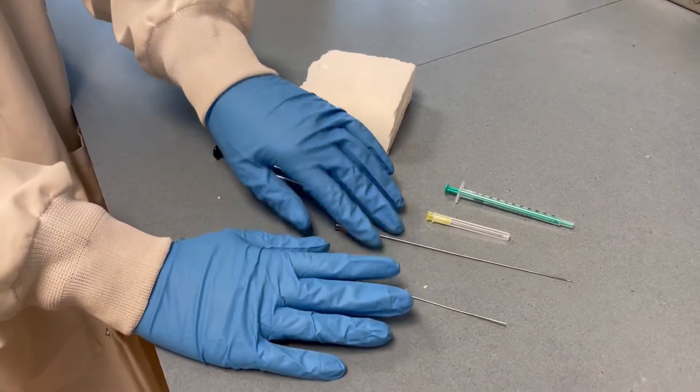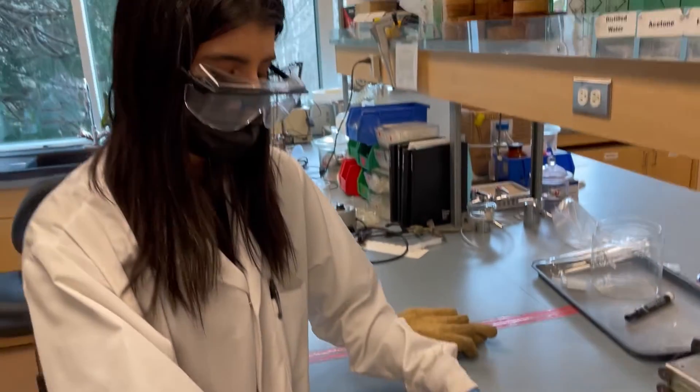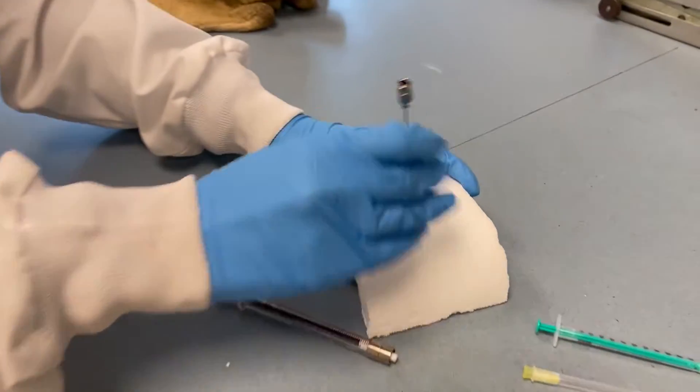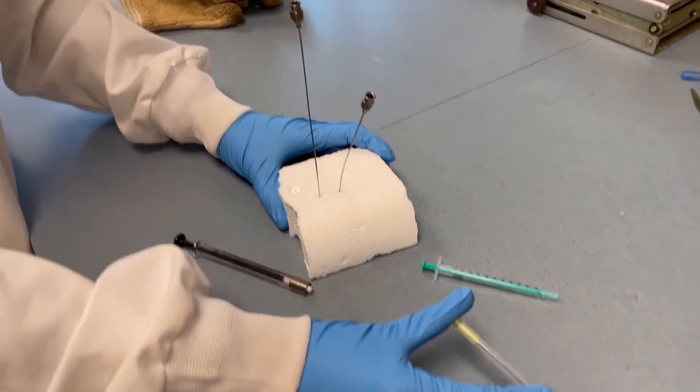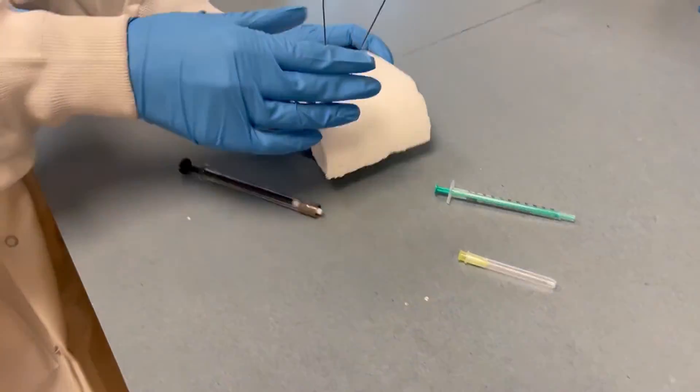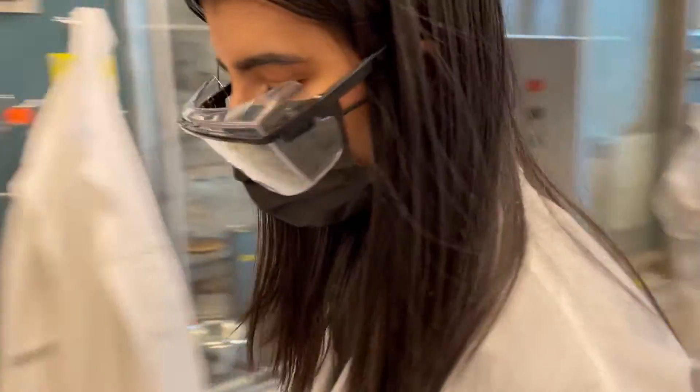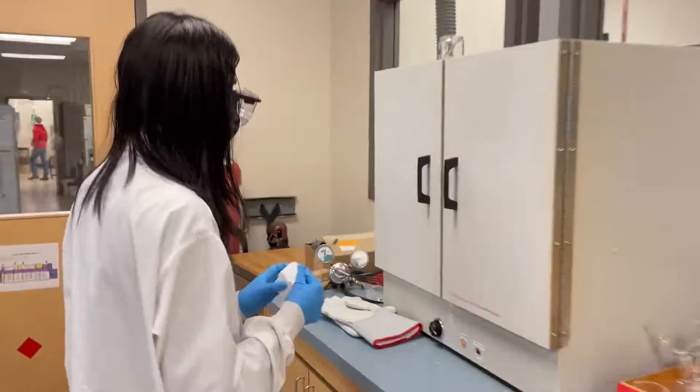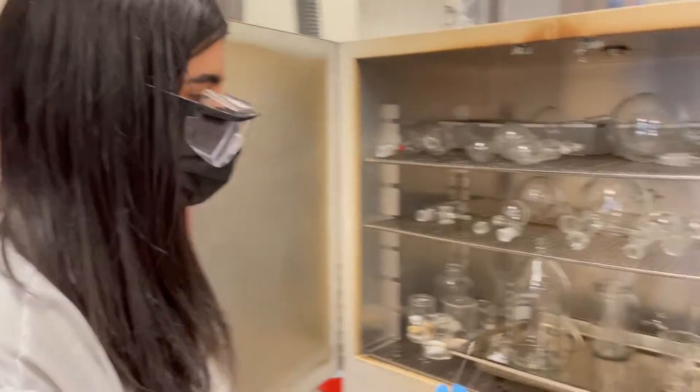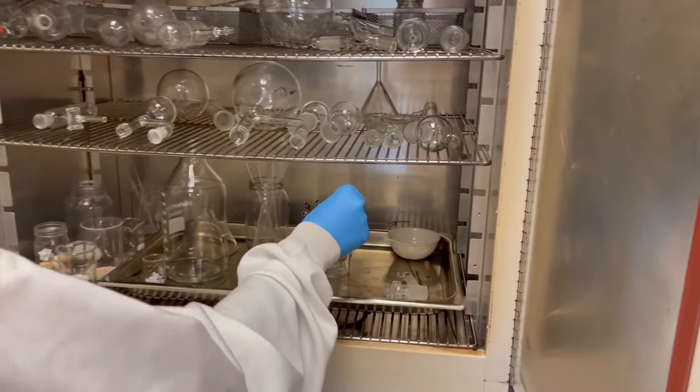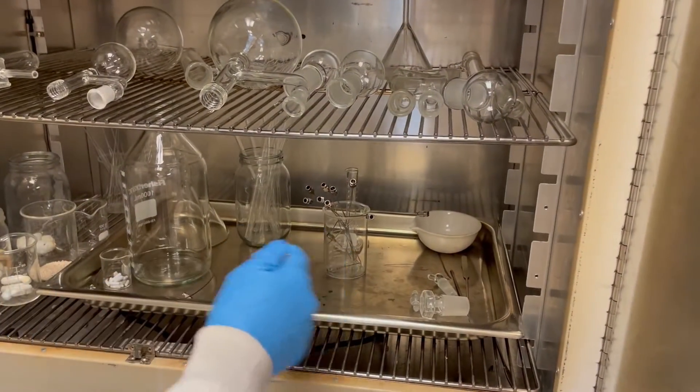If you're going to store needles outside of the oven, you want to place them in a styrofoam block so they can go in there. These ones can just be disposed of after use. To store these in the oven, they should be taped needle down in a beaker to prevent anyone from poking their hands.